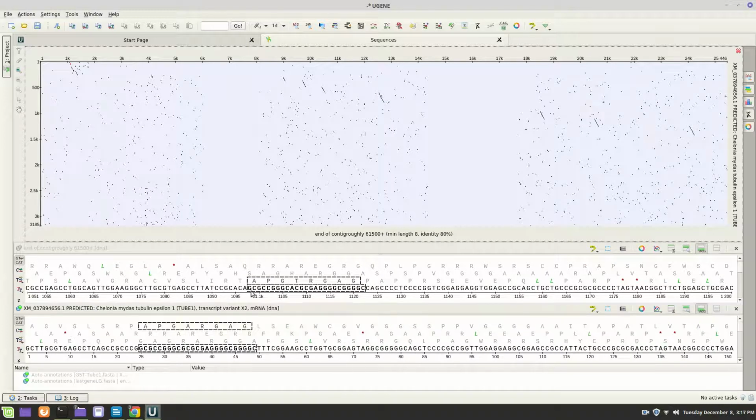So the best maybe a CA somewhere. It could be right there. You could make an argument that this is your transcription start site. Any place there's a CA would be a reasonable one, but then you'd have to also get in your promoter. You have to figure out what your promoter is and things like that. So it's probably not this one, but you could go in and make some arguments. Here's one, but just remember you're gonna have to have your core promoter in there.